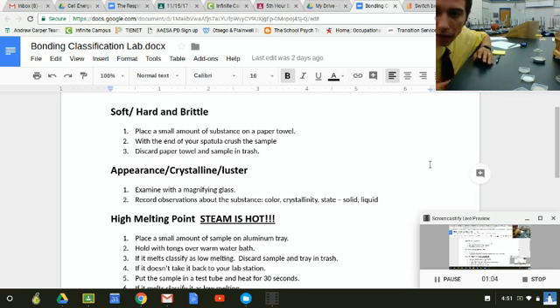Secondly, if you have a tie or loose hair, we're going to be using Bunsen burners. So be smart. Get those out of the way. Maybe put your hair up. So those are some safety things. Also, we're going to be having fire. We're going to have chemicals. We're going to have people with goggles on. Just be very careful when you're working in the lab.